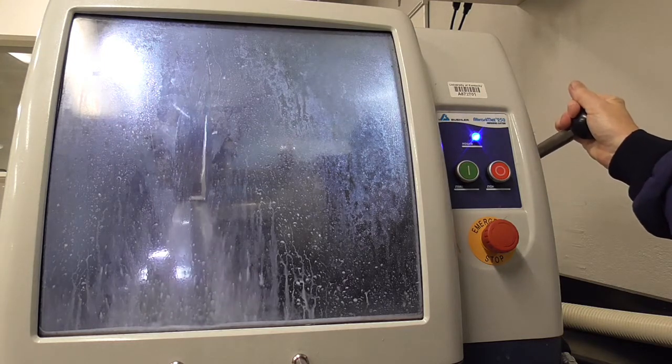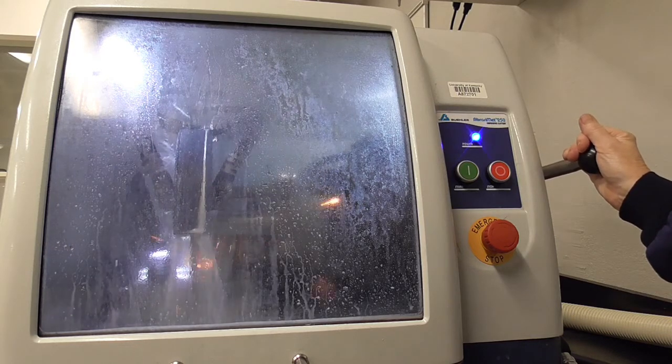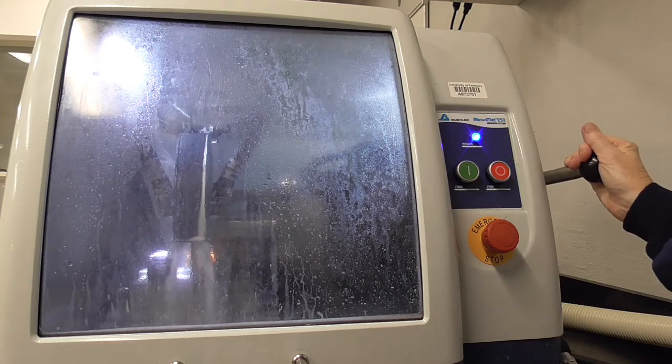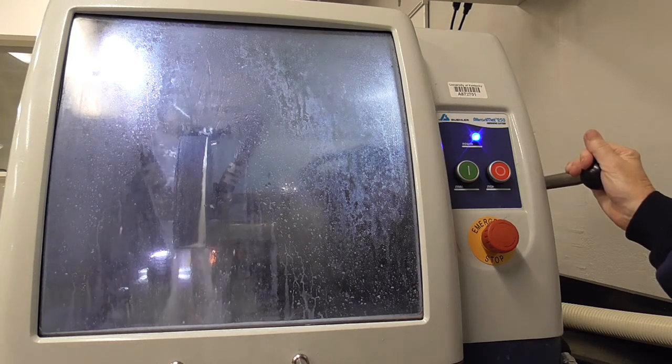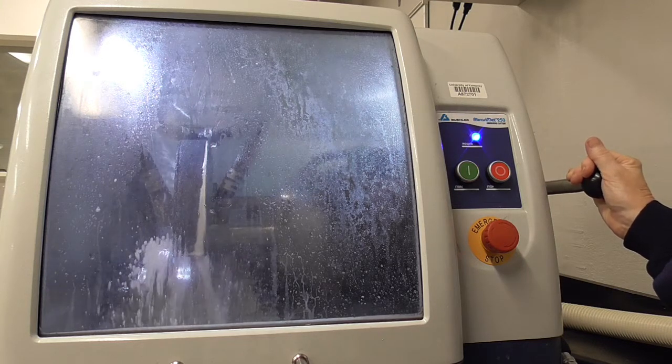When it hits the sample, you will feel resistance and hear a noise. Sparks are fine. You continue slowly moving down through your sample until the resistance or noise stops.